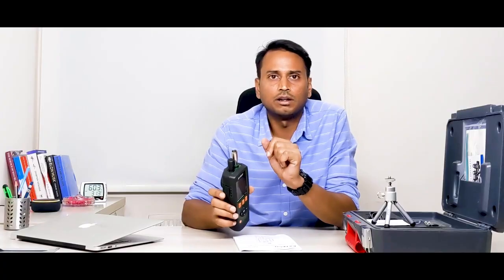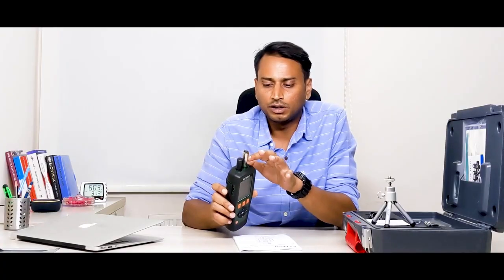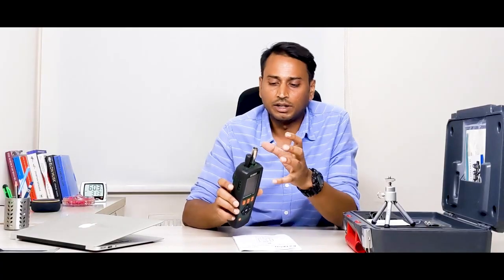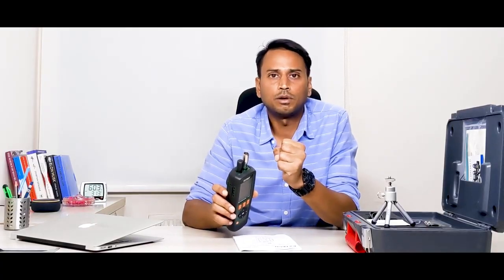So this particle counter works on the principle of sampling with a sampling pump. So it takes some air from the room, samples it and then gives the result. The flow rate of this instrument is 2.83 liters per minute with the help of an internal pump.